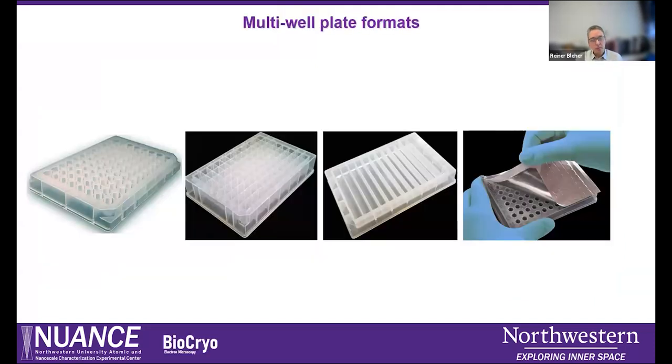The next step is to prepare the plates. We are using polypropylene plates because they are compatible with solvents and also with the resins that we are using. And we have different types. We have 96 well plates in general, can be plates with round wells, with square wells, with round bottoms, with flat bottoms. Or if all samples have the same treatment, we can use those trough plates. So all 8 capsules will dive into the same trough and liquids will be aspirated and dispensed.